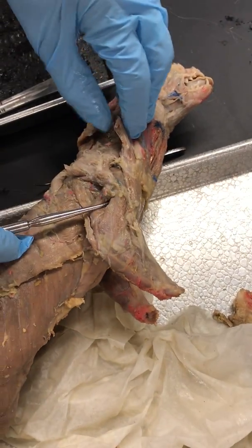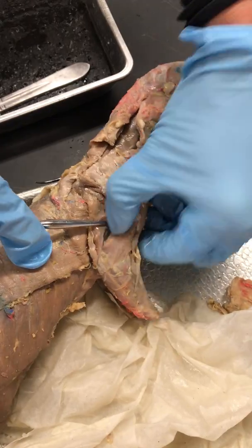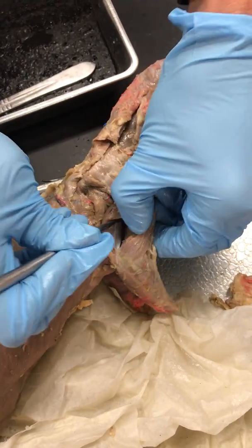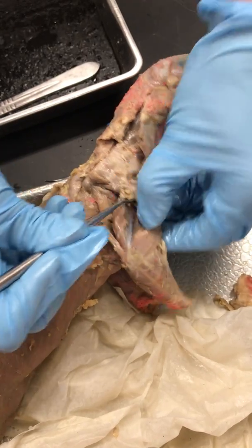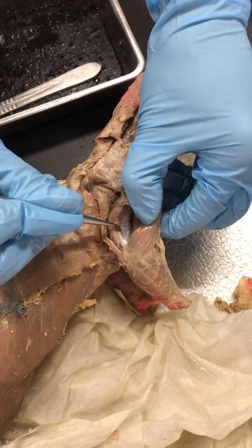Triceps Medial Head — it's going to be between these two. Sometimes you get a better view of it from the other side, but let's see if we can get it to stand out.